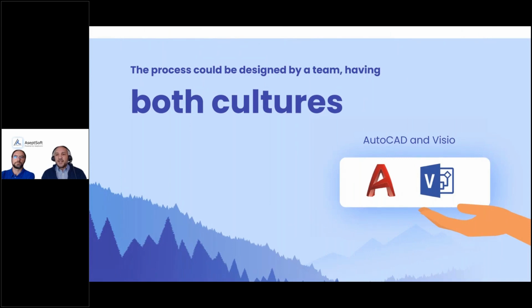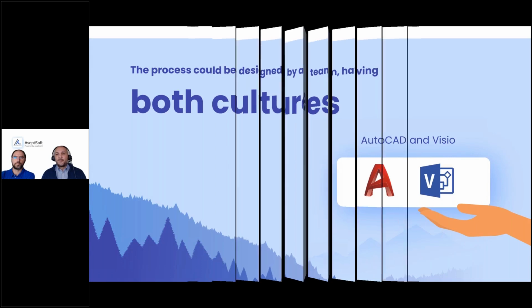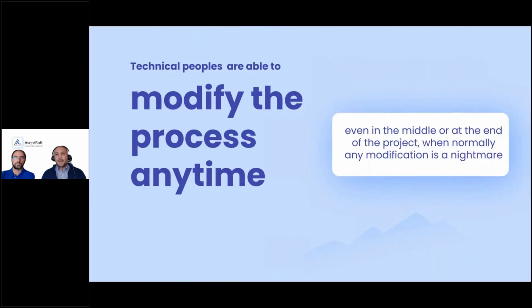Technicultural diversity. The processes can be designed by a team having both cultures, AutoCAD and Visio. Usually, modifications and changes of the process are a nightmare. No more with AseptSoft. Doesn't matter if at the end or in the middle of a project, technical people are able to modify the process anytime. How?